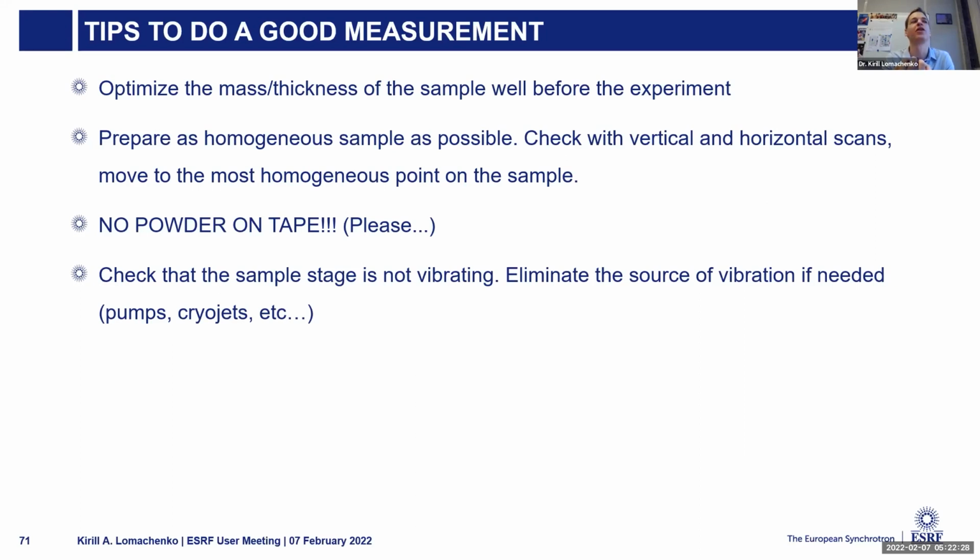And if then you have an air conditioner that switches on and off and creates a flow of air once in a while around your cell, you can have sometimes very warm air around the cell, sometimes very cold air, well, relatively cold air. The difference can be hundreds of degrees if you heat to, I don't know, 500 K or 500 Celsius. And this difference, you can see it in your XAS data as noise.